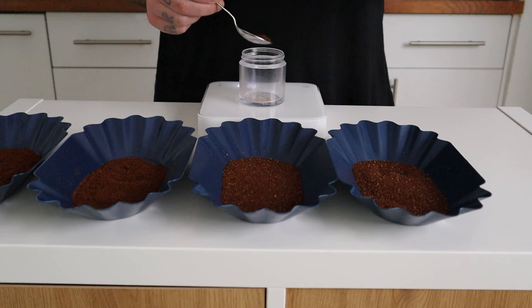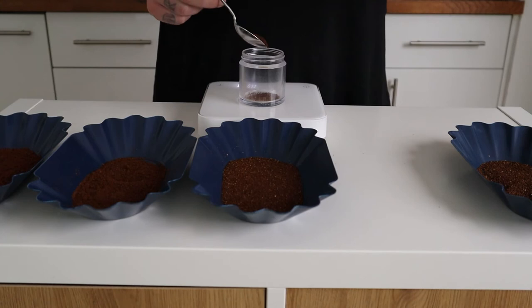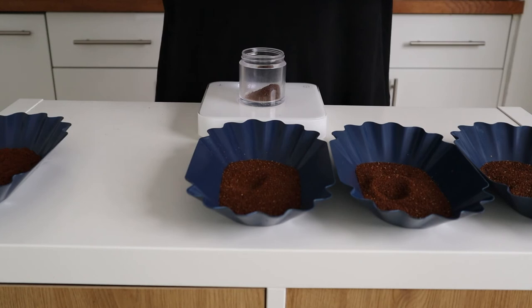So, after this experiment, another question came to mind. Am I able to design the flavor notes of my cup? What happens if I take a specific amount of different distributions and mix them together? So, I started to mix some of these distributions using different ratios. I uploaded samples of each mix in the CPA and then I blind tested them.